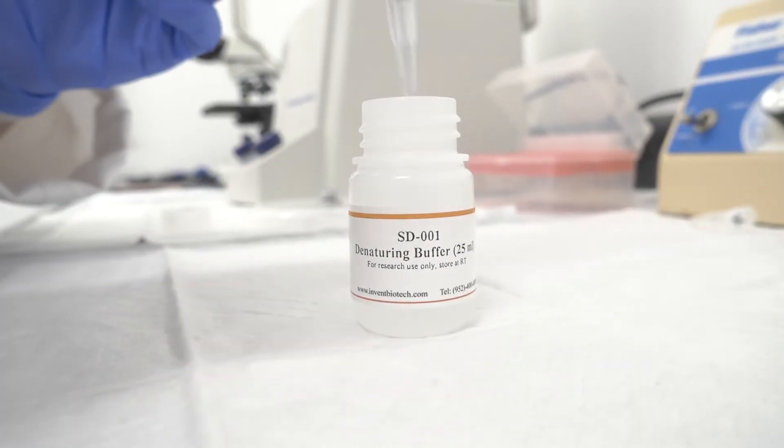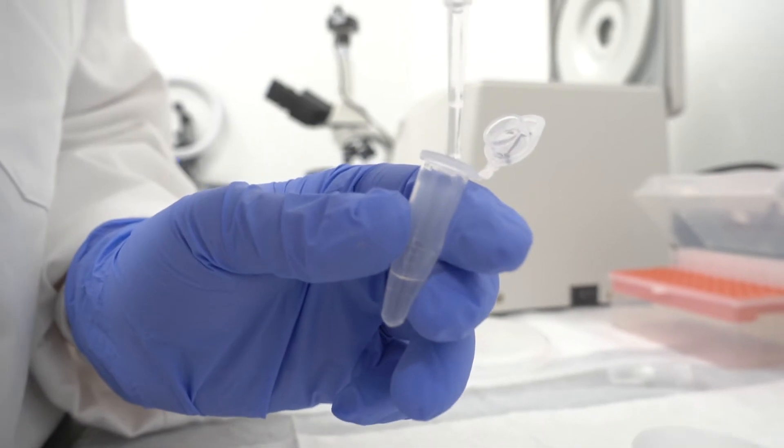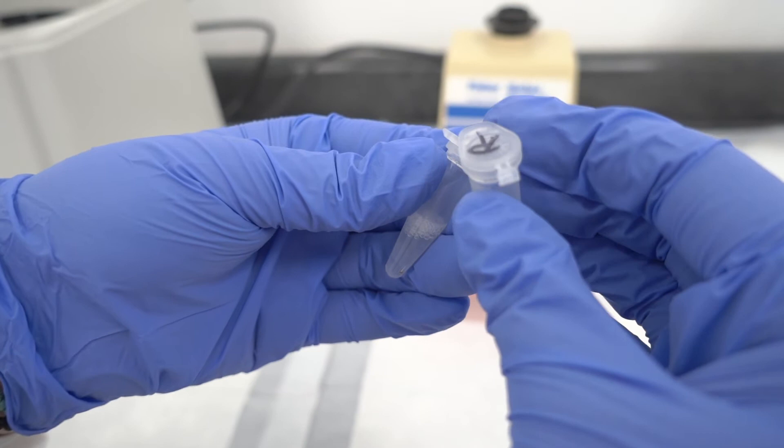We both started with 20 microliters of cell suspension and we've added 400 microliters of Invent MINUTE buffer and 400 microliters of the RIPA buffer.